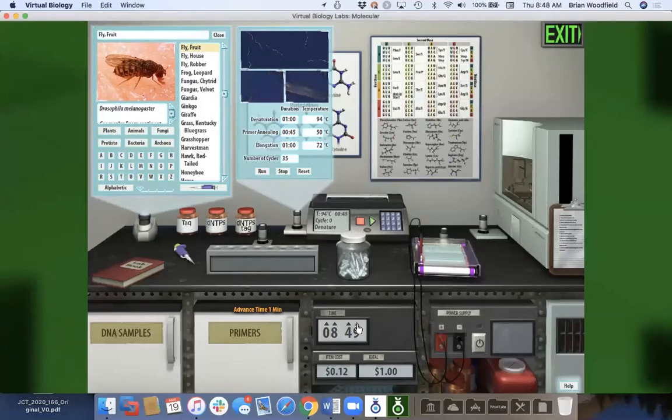I'm in the denature stage of things, and so it's going up, and I can now advance to my anneal. I can advance again to go. Now I'm going to elongation, so I kind of missed it because I'm only advancing by 1 minute. So here's my animation showing elongation. So we have these animations showing what's going on, and so then we start showing that we're amplifying these things as they go.